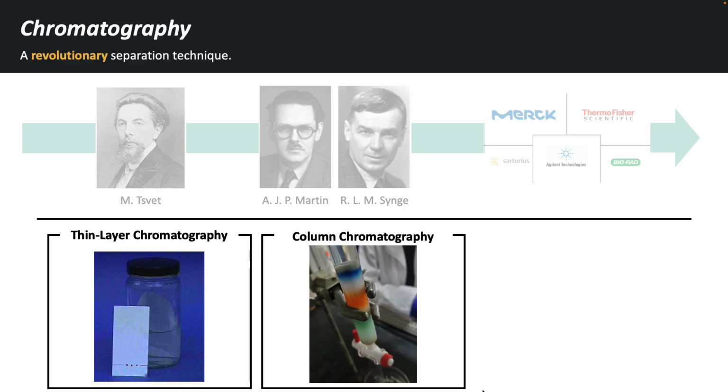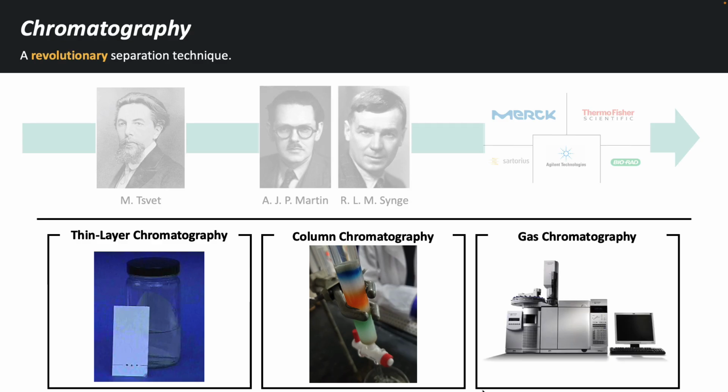But in a few experiments, we will be using column chromatography, and even later still, we will look at something called gas chromatography. Now, each of these look very, very different on their face, but they all abide the same basic principles discovered by Tsvet and then expanded upon by Martin and Synge so long ago.